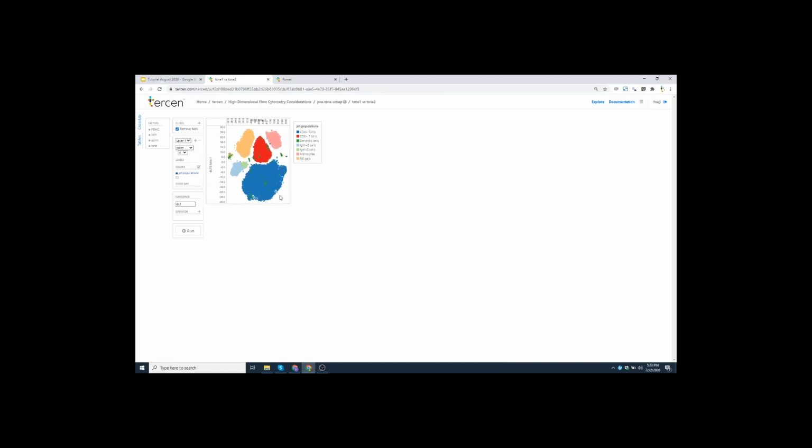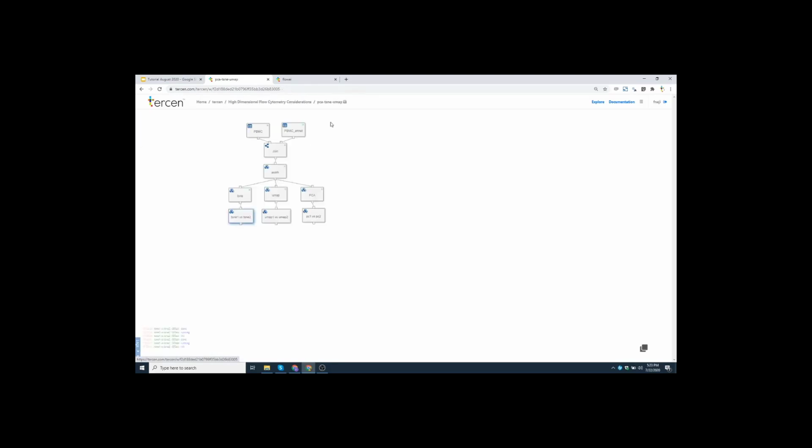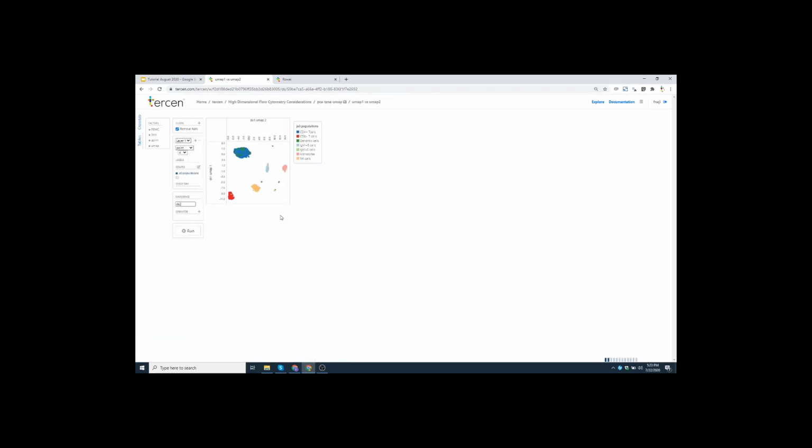It's much more spread, as you can see, compared to UMAP. UMAP is tighter. I'll show you. But you can see that tSNE is separating the different population groups here. And this is UMAP. However, UMAP will do something a little bit better in terms of keeping the global and local structures.